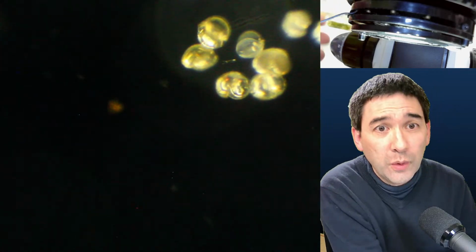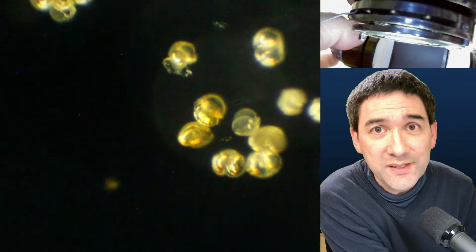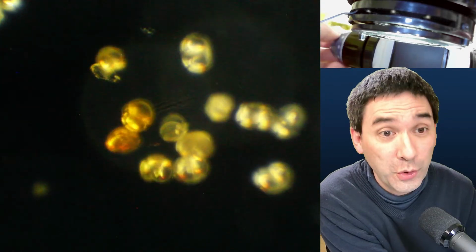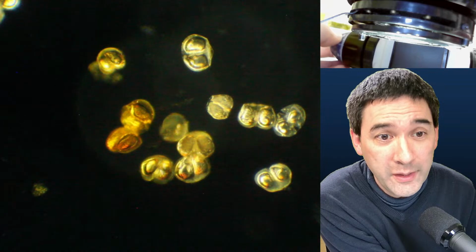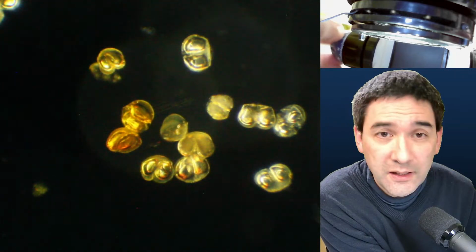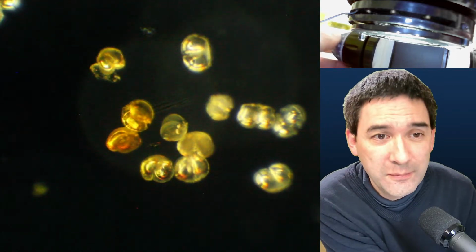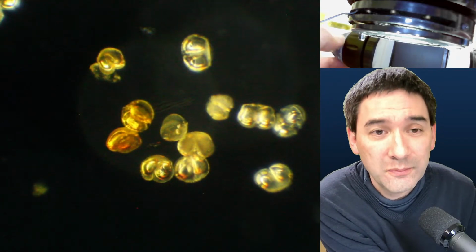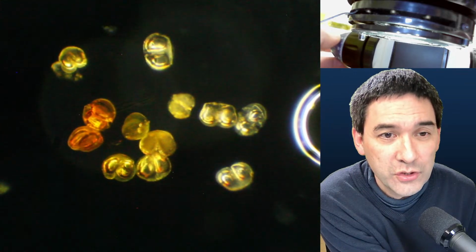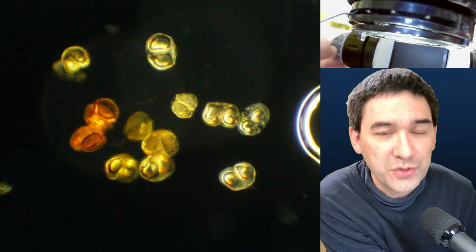In case you're wondering why I've chosen pollen and why I've done the test series, the reason is because spring is coming, or we're starting off here in Central Europe, where I am, and I want to make some pollen slides. Normally for mounting pollen you use glycerin gelatin. According to Kaiser there are two versions, and glycerol gelatin according to Kisser. I just wanted to also try the other mounting media.